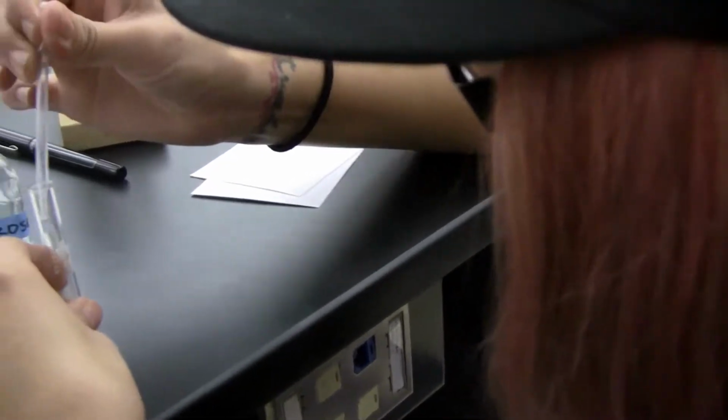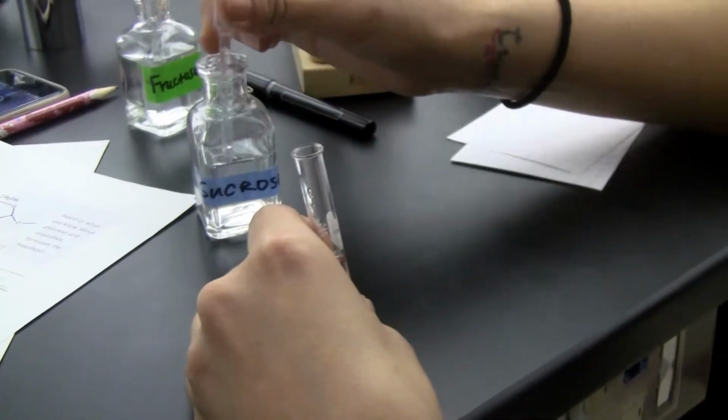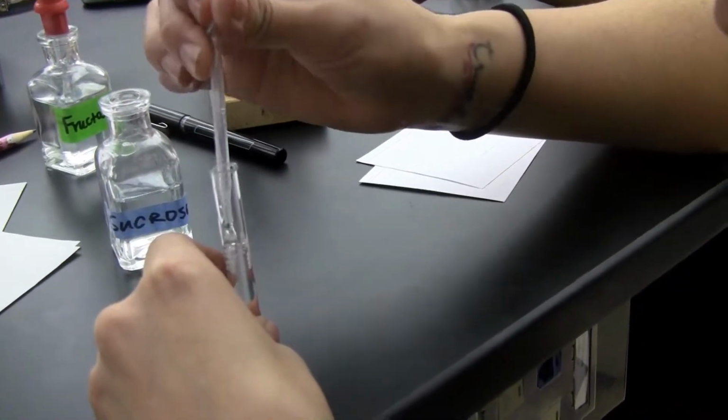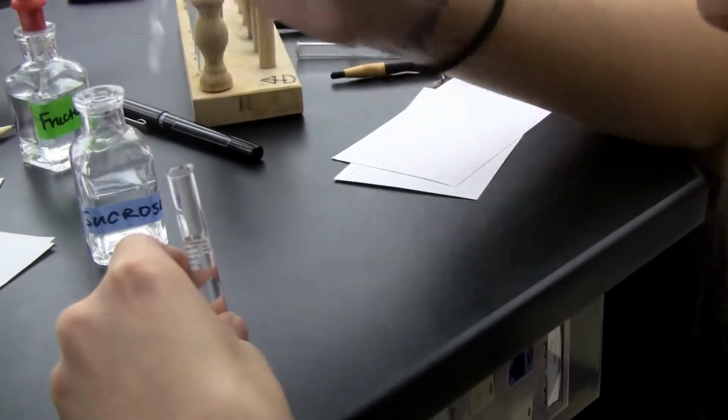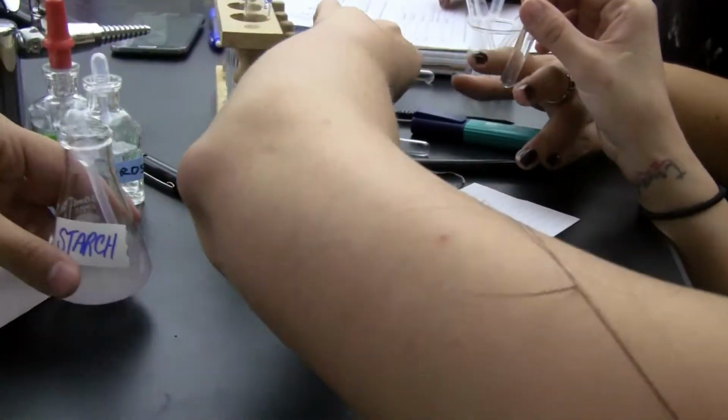We'll just have you add the yeast. Where am I going to add it? To the small tubes. Is that the yeast, right? Mm-hmm. Sucrose. And then what's next? Starch is next. Don't forget to shake the starch.